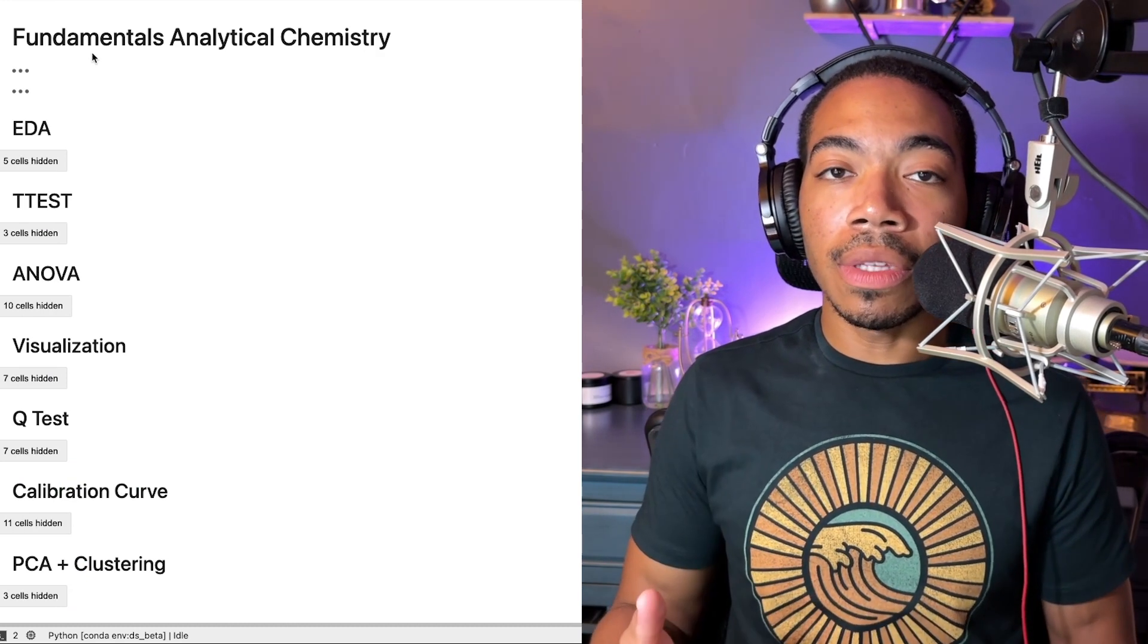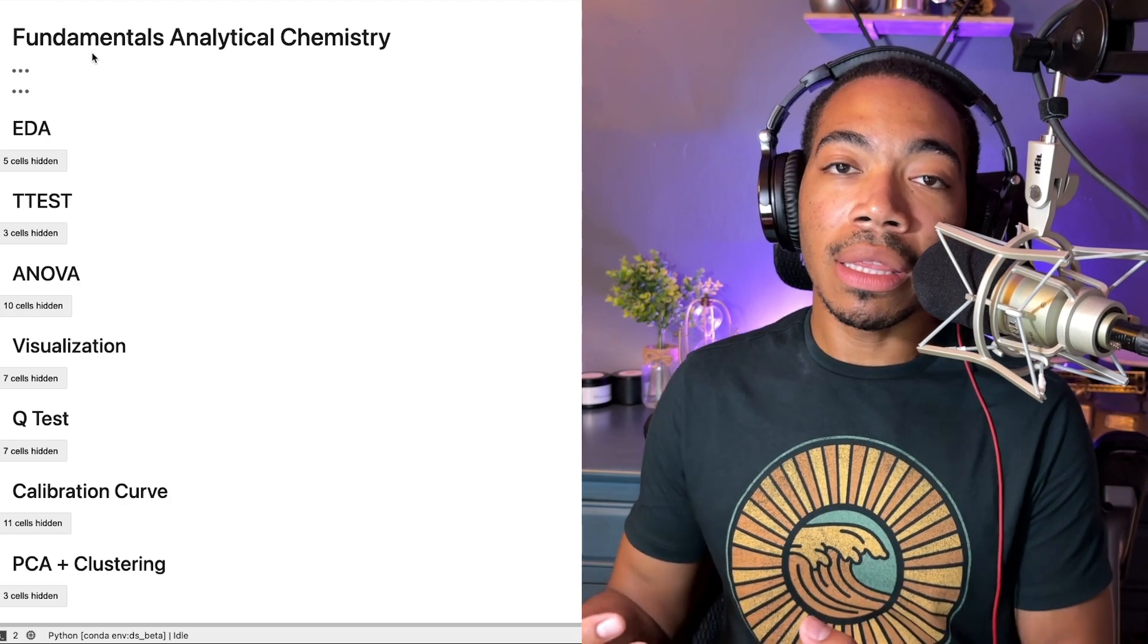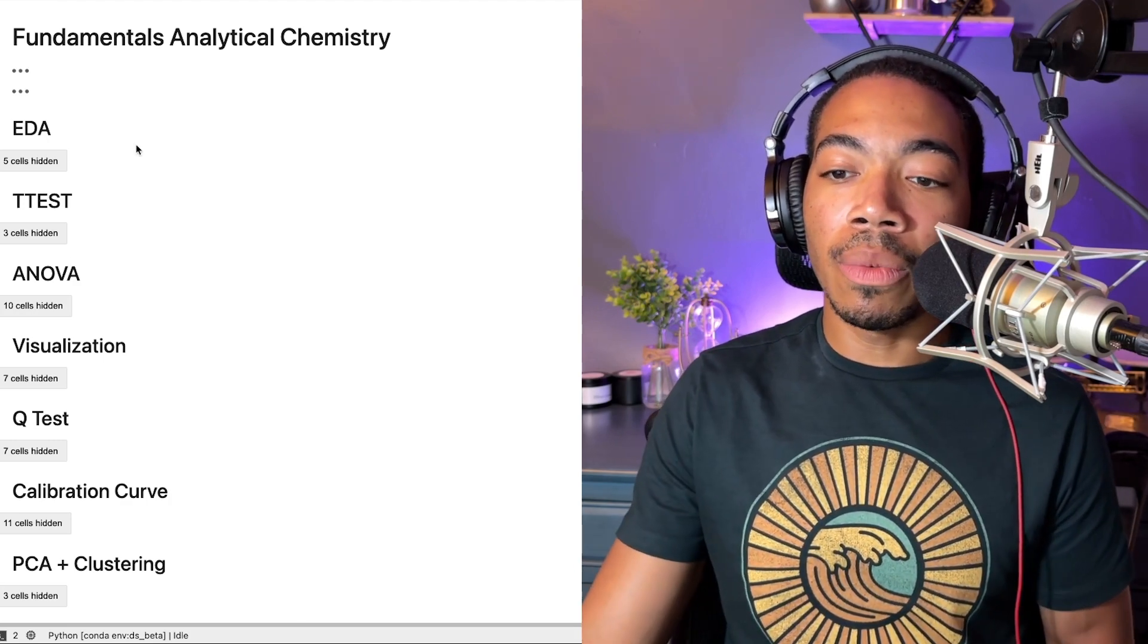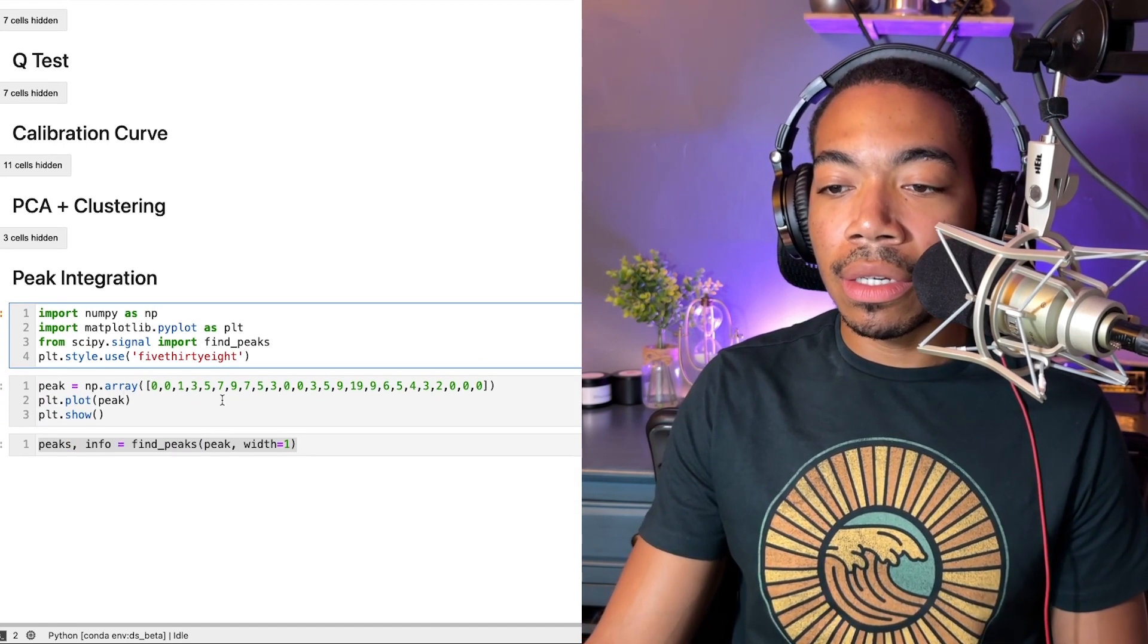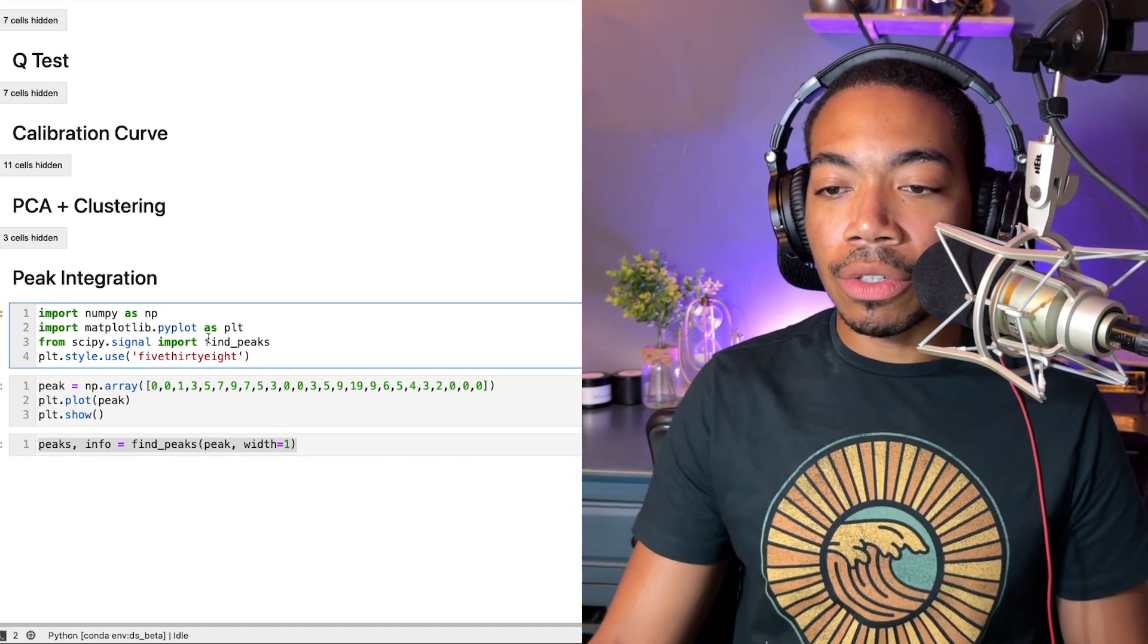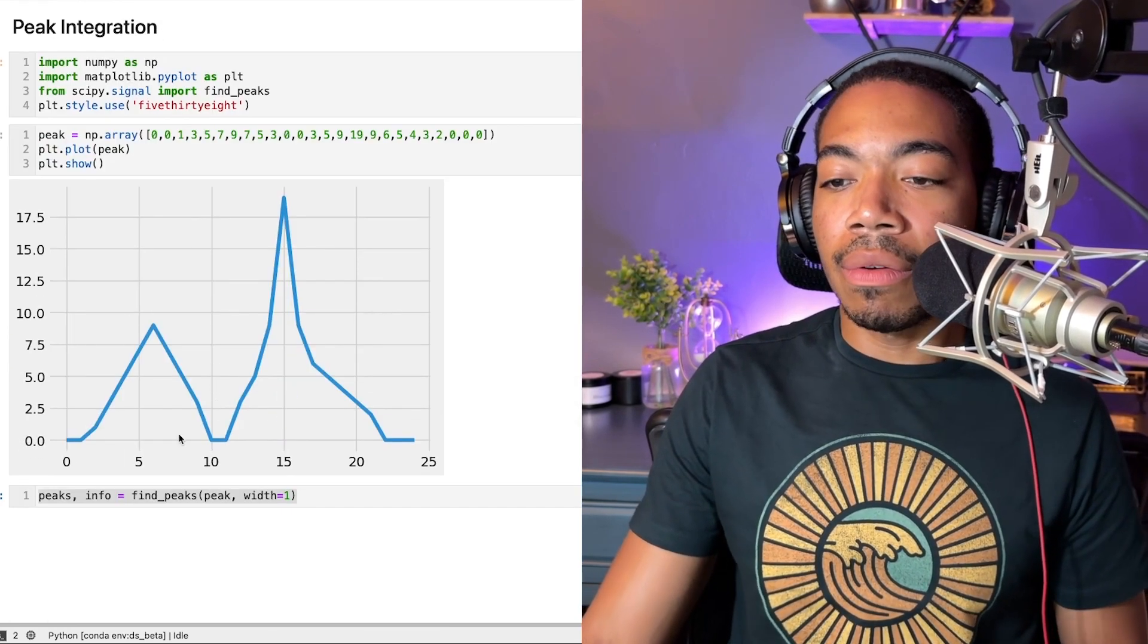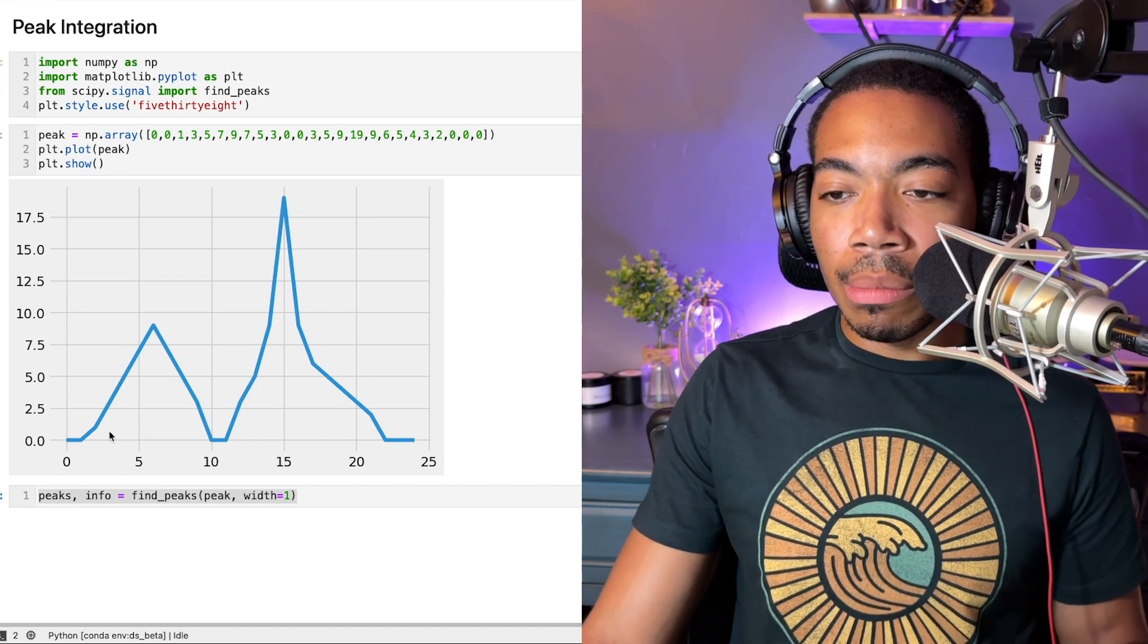The goal of this series is to demonstrate how we can implement many of these techniques using Python and update many of our approaches with newer tools. In this case, I have a dataset called peak, and if we illustrate what this looks like, you see that we have two peaks, nothing particularly fancy.